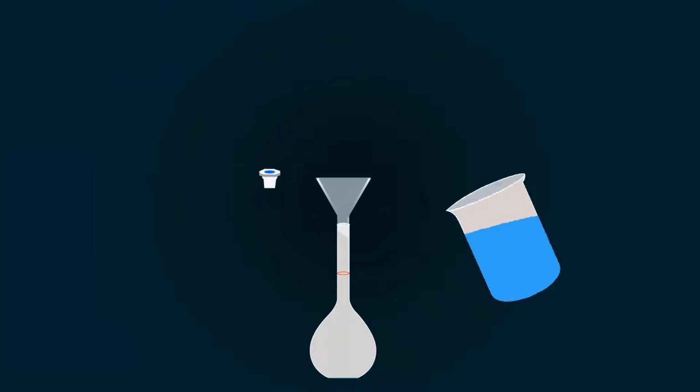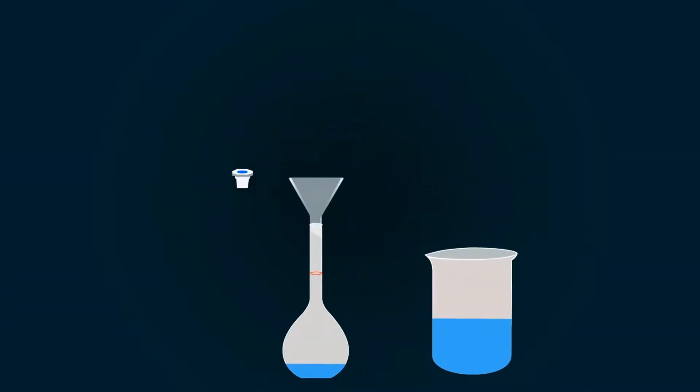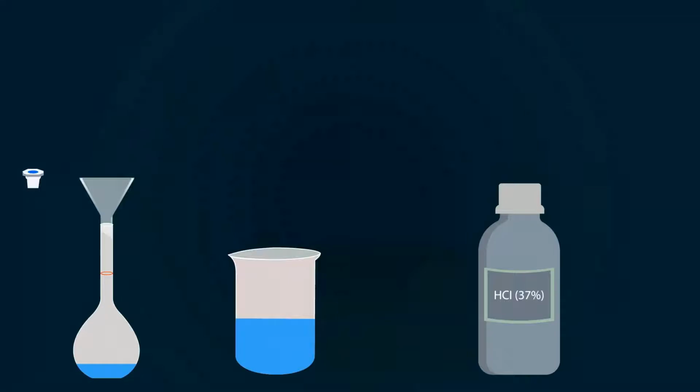In this video, you will learn the whole procedure of producing 1 molar HCl solution from 37% HCl.